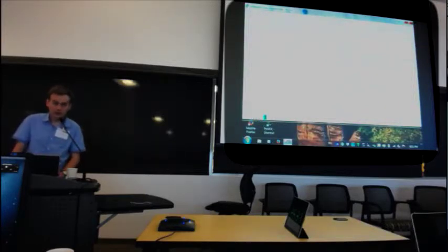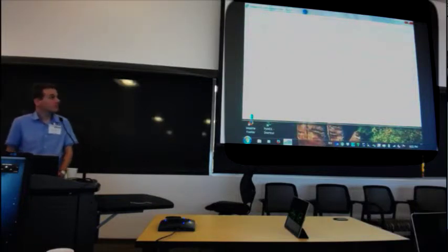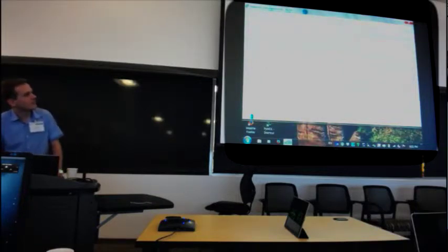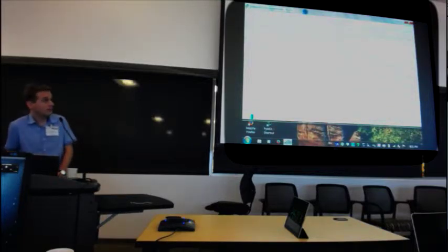And if you check whether the jobs are running, you can type this command, bjobs, and you see that my jobs are running. Here you should see your username. It shouldn't take long. It will take about 5 or 6 minutes to convert this run.